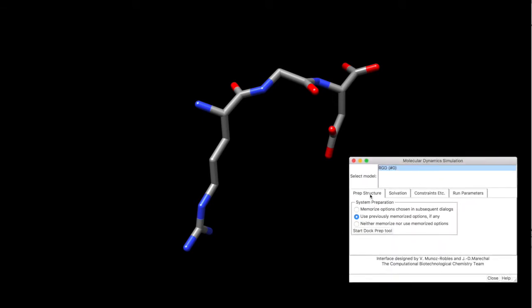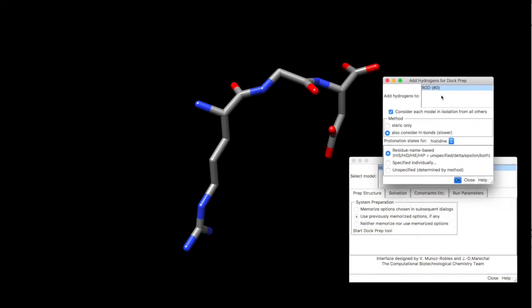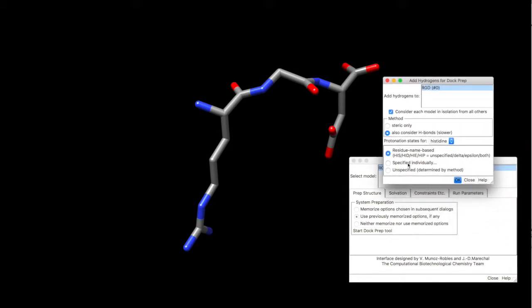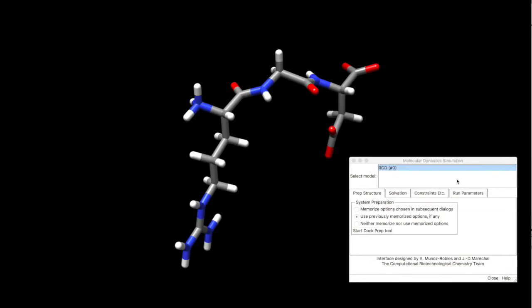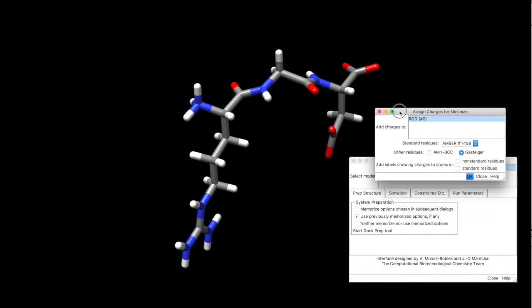First we have to prep our structure, so we click on start Dock Prep tool, this will add hydrogens and charges to our atoms, click ok, ok, protons are added.